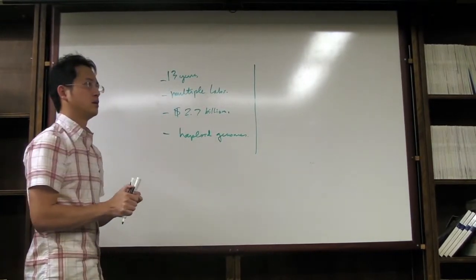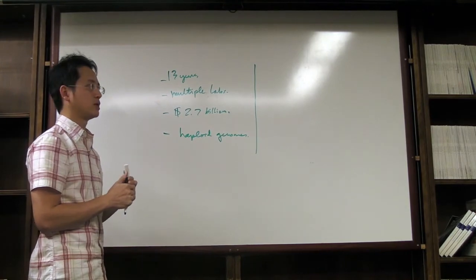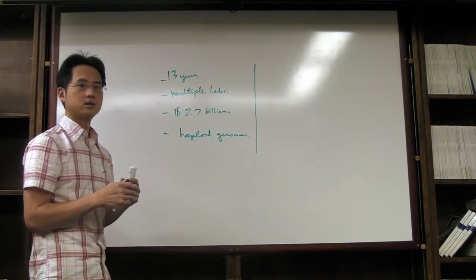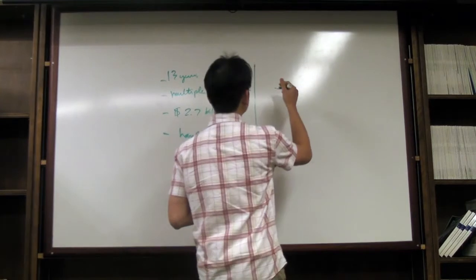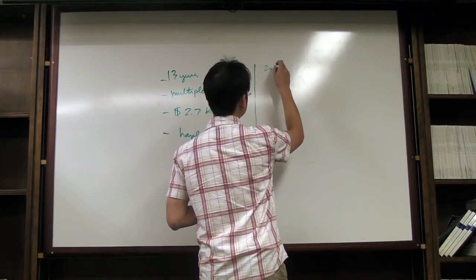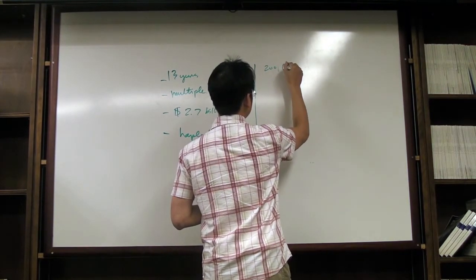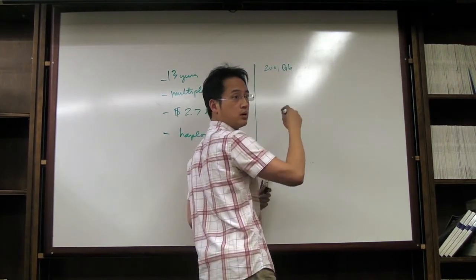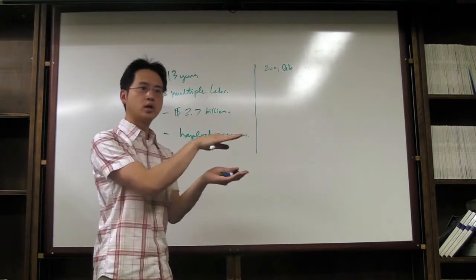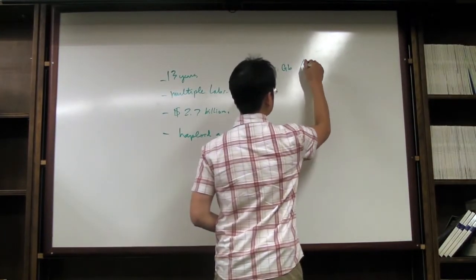So today, let's just put into perspective. Today, with a next-gen sequencing platform, let's just throw out there an Illumina sequencing instrument, you can get very good high quality data, let's just say 200 gigabases per run. On the HiSeq 2000, there are two flow cells that you can do. You just dedicate one full cell. You can do this roughly in 10 days.